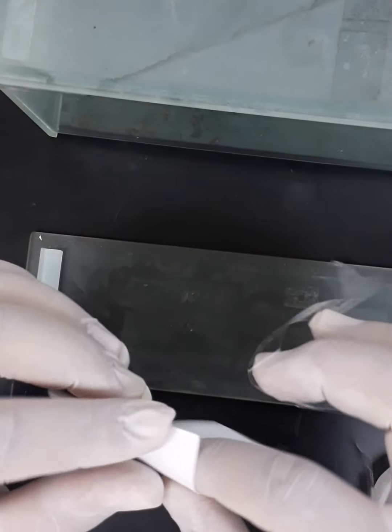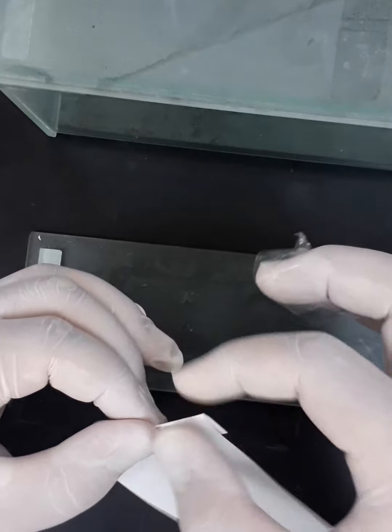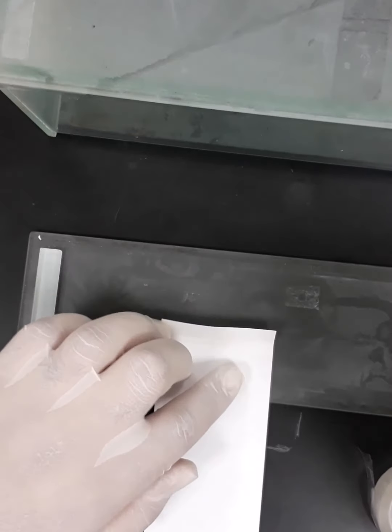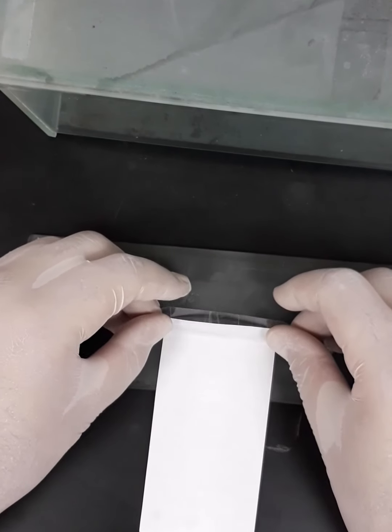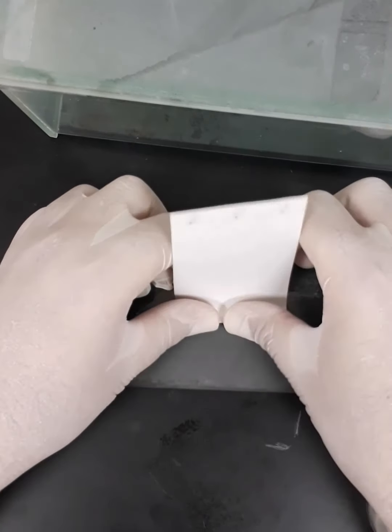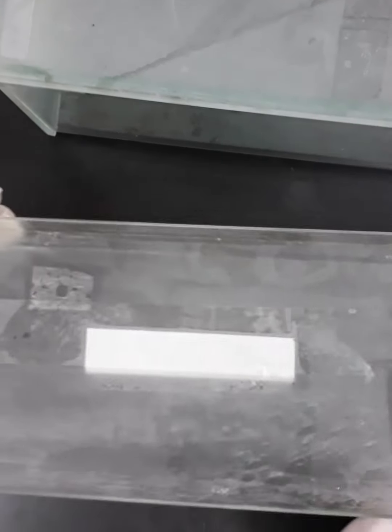So now I'm going to bend the apical part around 1 centimeter. If you remember when we said 11 plus 1, so this is the 1 extra. So I'm going to just bend it and I'm going to fix it here on the bottom of the cover of the chromatographic tank. Of course, there are many ways to fix the chromatographic paper in the chromatographic tank, but I think this is the most efficient way from my point of view, for sure. Okay, so now this is my chromatographic paper. It's ready, and I have just to place it inside the chromatographic tank.